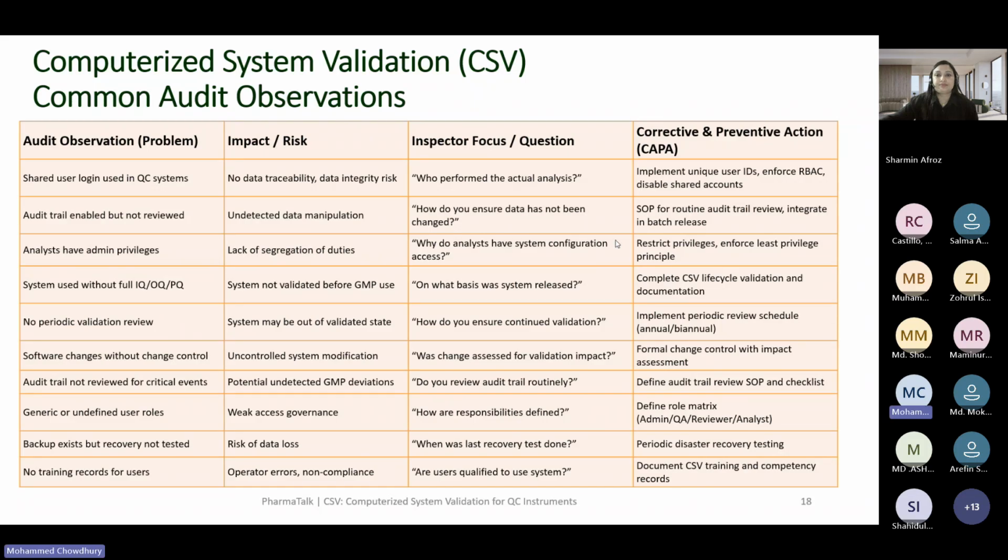I'd like to add, for such things, the easy solution is to update the privilege of the user level. Generally, recipe creation is not an admin job.